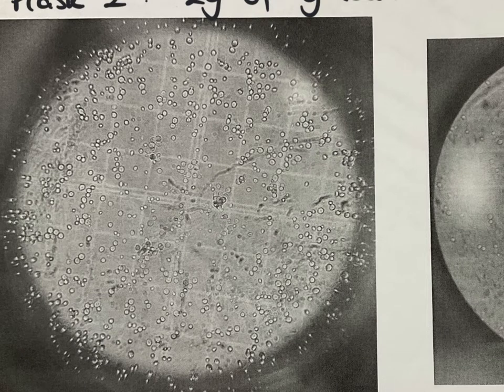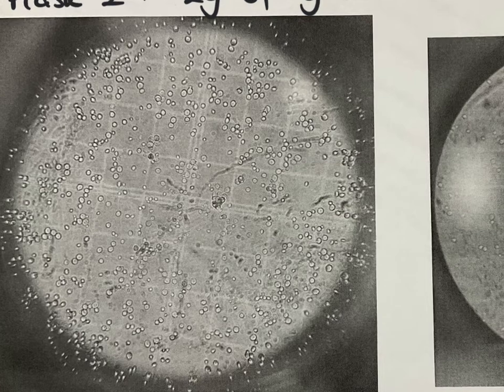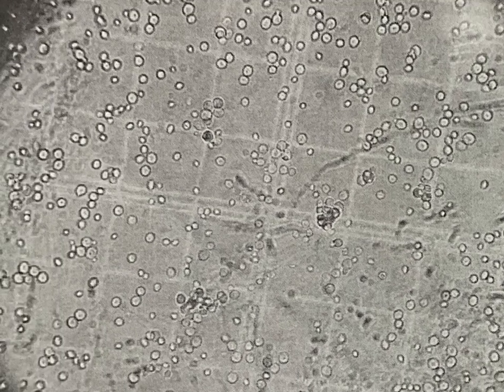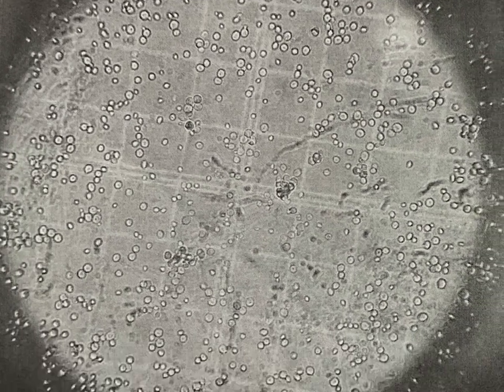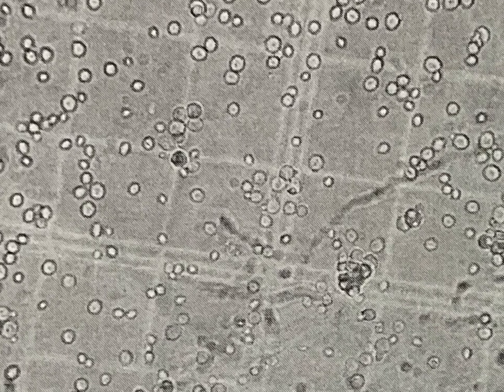Then you need to pick one of these squares here. Now, I'm just going to take this at random. There's a few clumps, so there's a clump there, which we're going to avoid because that's an issue later on.